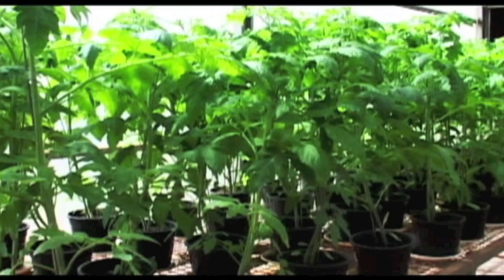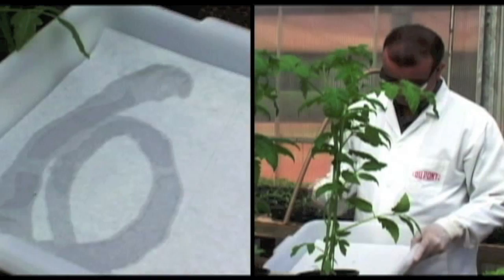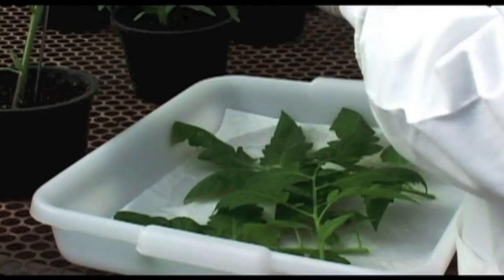In order to keep the leaves in good condition while handling and preparing them for the bioassay, they should be kept in contact with a wet paper towel. In this example, the technician starts collecting leaves from the top third of the plant.